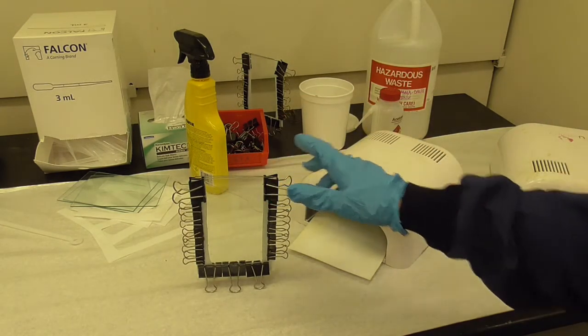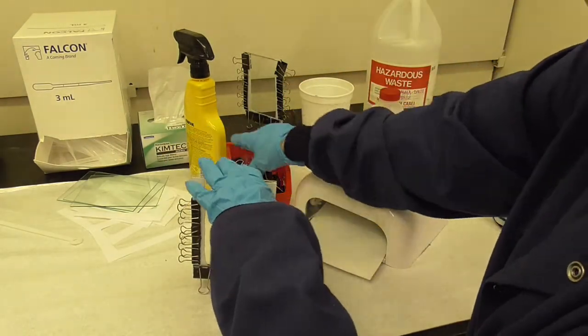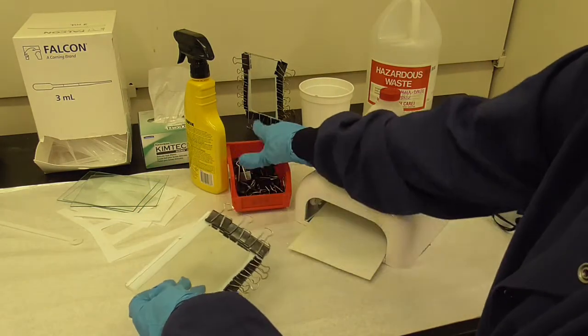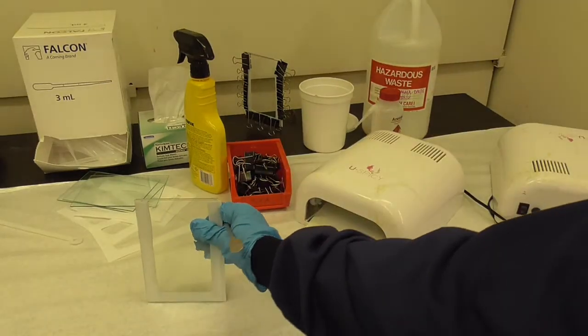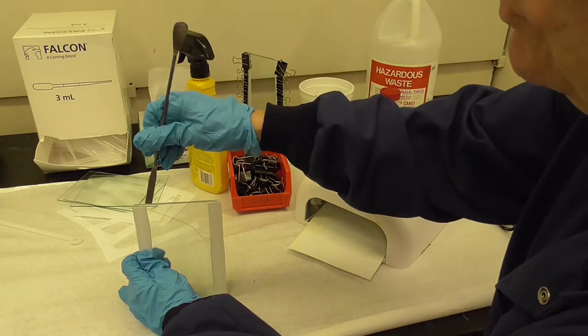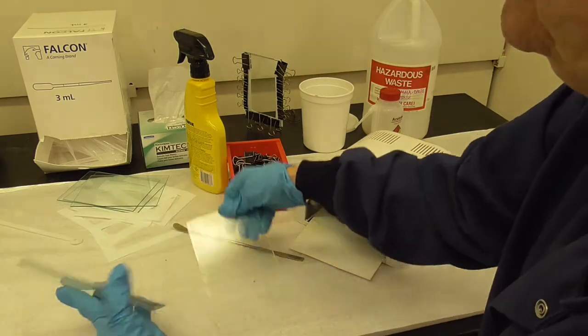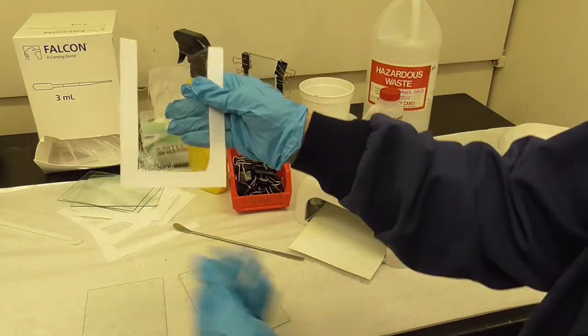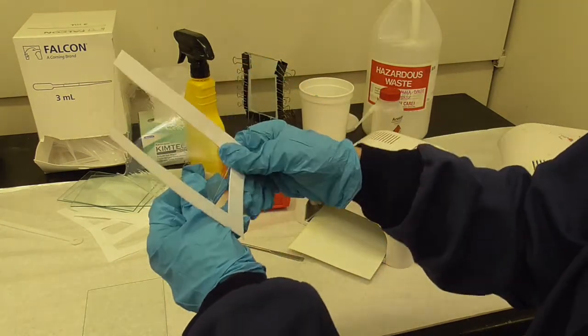I can go ahead and take the clips off. If the glass is stuck together you can take the end of your spatula and kind of twist it and that will make it come apart. Then we can peel the film off along with the spacer.